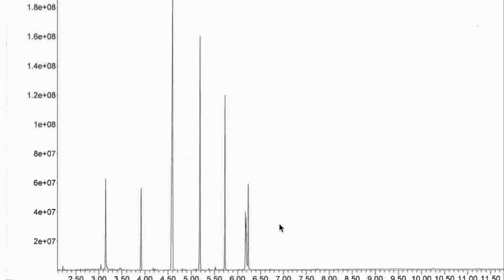So for each student, I just printed out one scan, one of these time points. Each point along this trace is a scan, and I only picked one of them. For this particular student over here, it looks like I picked scan number 701, which was at 5.7 minutes. That is underneath this peak over here. That's where I took the scan. For different students, I was choosing maybe this large peak or one of these peaks over here. A couple students, I chose this peak. So it was pretty random as far as which peak I chose to print out on your GC printout.